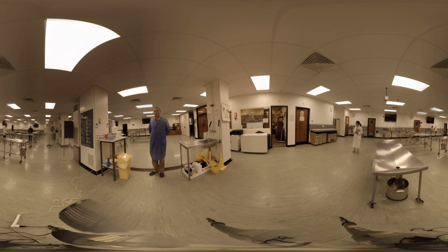When you enter the DR, at each end there is a station like this, and the first thing that you should do is put on a pair of gloves of appropriate size. I actually recommend that you frequently double glove to prevent any smells from sticking to your hands.